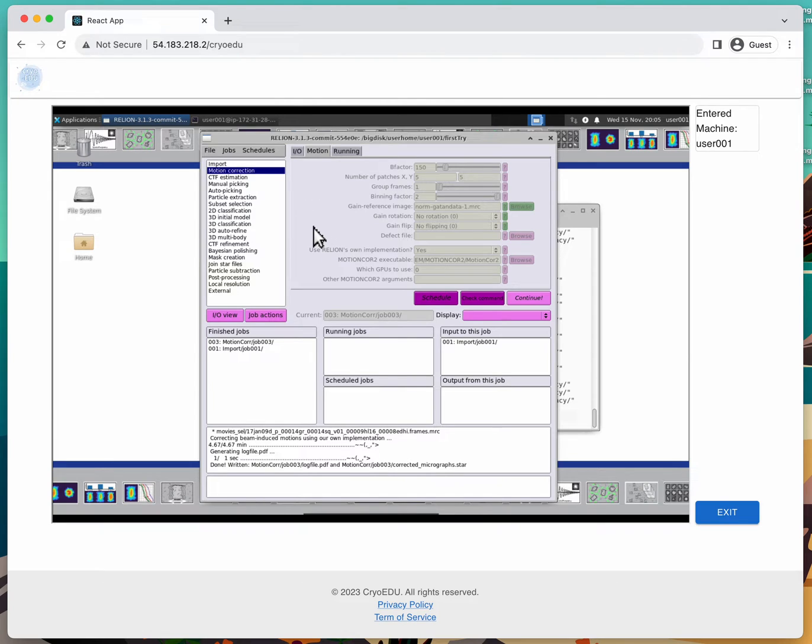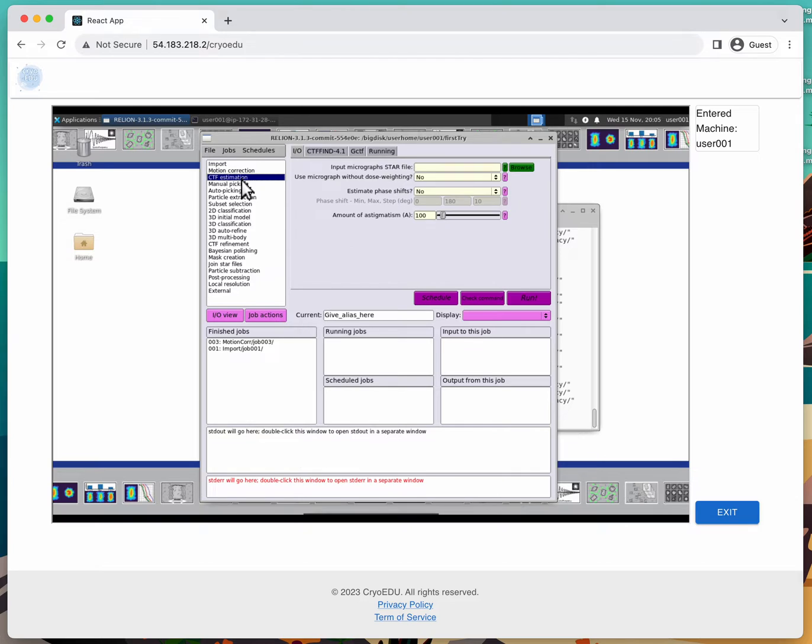All right, the next step is going to be estimating the CTF from the micrographs that we just aligned. So CTF estimation is the next job down from motion correction. In this case, we actually don't have a lot of parameters, or any parameters, for users to change, because we felt like, as this is intro level, we wanted you to focus on more downstream tasks. That said, we still have to go through it because CTF information is still required for later steps.